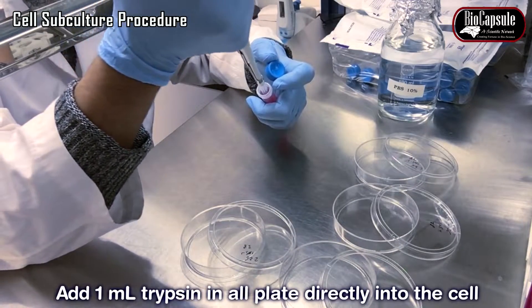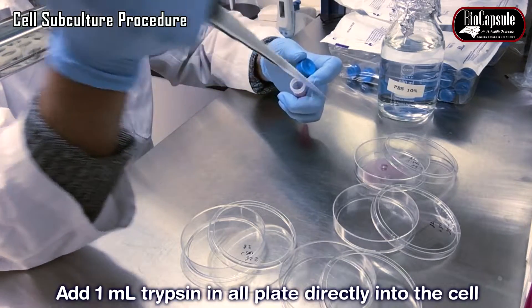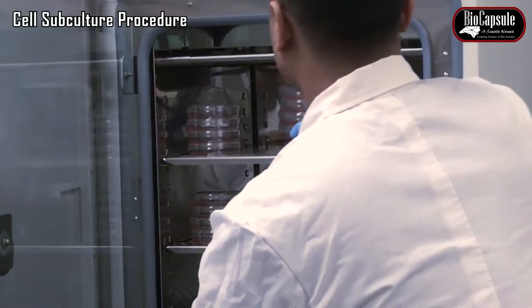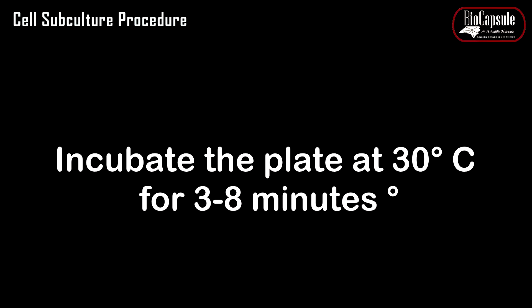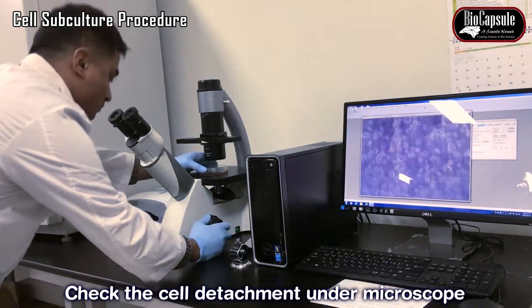Add about 1 ml of trypsin to the cells. The volume of trypsin depends on the cell type and its adherent nature. Incubate the plate in the incubator for 3 to 8 minutes depending on the cell type. After incubation, check cell detachment under the microscope.